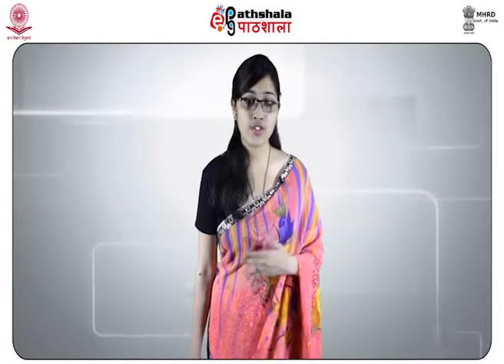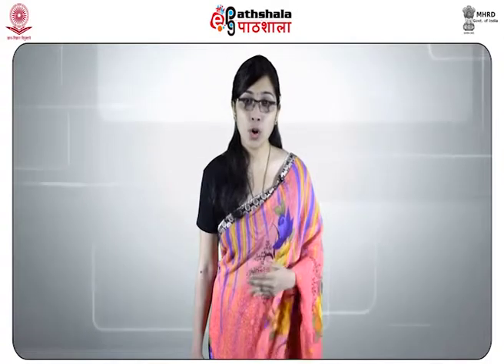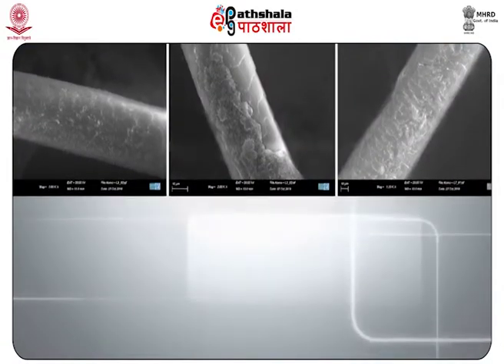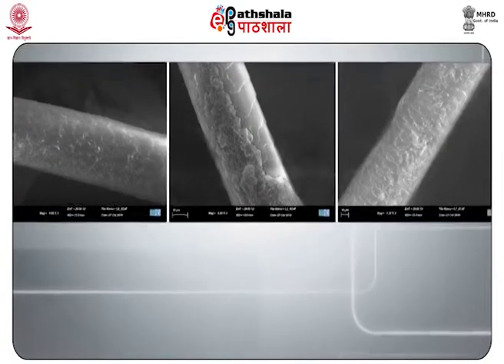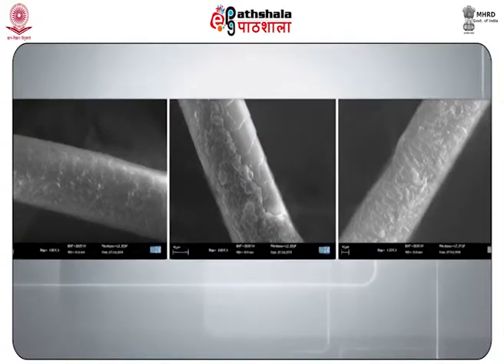The examiner's ability to observe certain features is enhanced by using a polarized light microscope. Next comes the comparison microscope. While comparing microscopic characteristics, we need a high quality transmitted light microscope. The high quality objectives are very important.